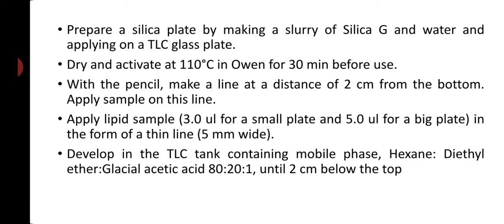Then with the help of a pencil, you have to make a line at a distance of 2 centimeter from the bottom. So you have to draw a line 2 centimeter above the bottom with the help of a scale and a pencil. Then you have to apply a lipid sample directly as you have prepared, I told you, cholesterol or any oil which is already prepared in some non-polar solvent. So take 3 microliter for a small plate and 5 microliter for a big plate.